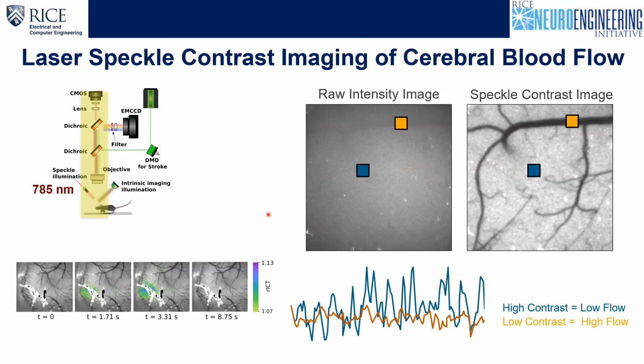So this naturally, since the technique that I described is just the speckle pattern on the camera, it is limited only by the camera frame rate. We usually run the camera at 70-80 FPS, but there are higher speed cameras as well, and you can go beyond that. Then you post process it.